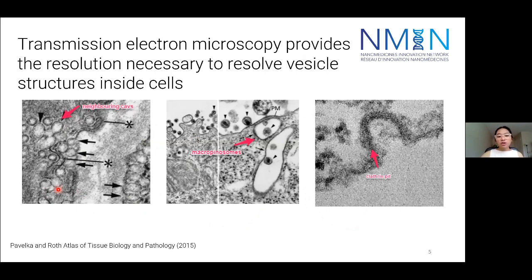So as you can tell from these images, these endocytic vesicles are very difficult to characterize subjectively and distinguish from one another, as one, for example, can easily mistake a caveolae for a clathrin vesicle. Now, this inconsistency and the challenge in subjectively classifying different vesicle types on TEM images is the rationale for my project this summer.